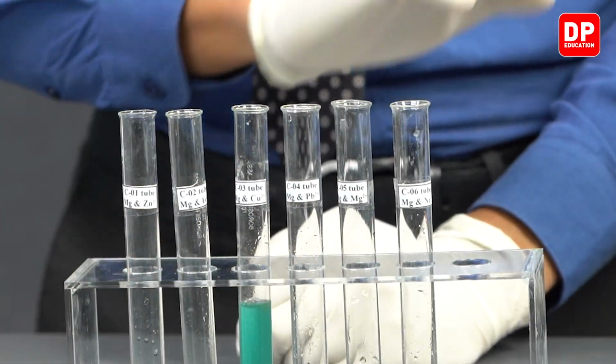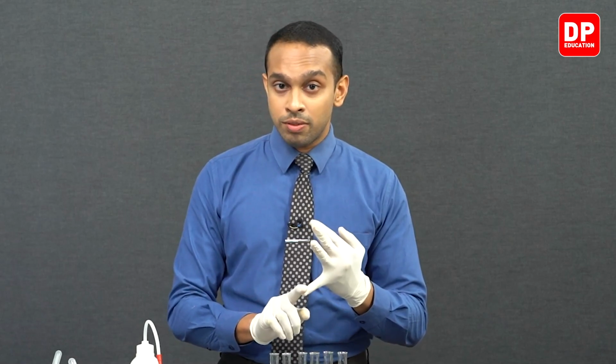So after this third part of our experiment, we can conclude magnesium reacted with the most amount of metal ions that we found over here. Magnesium reacted with 4 solutions out of the 6 solutions we have over here, indicating magnesium was more reactive than all of those metals. So what are the metals that magnesium was more reactive than?